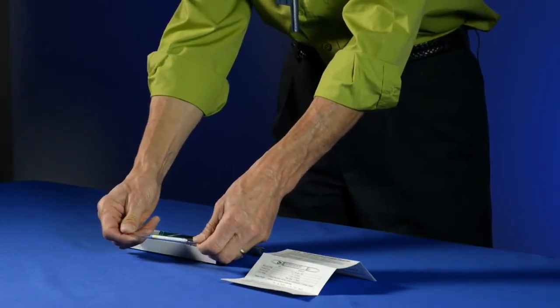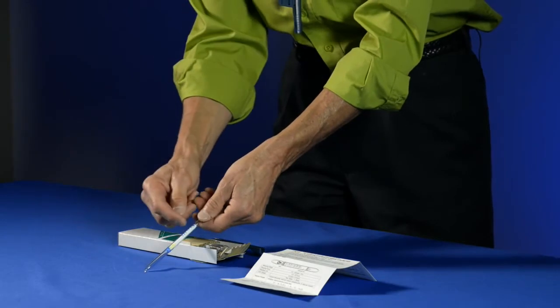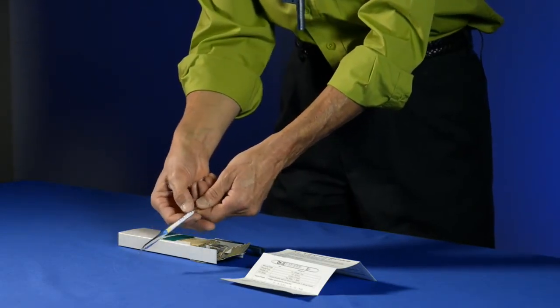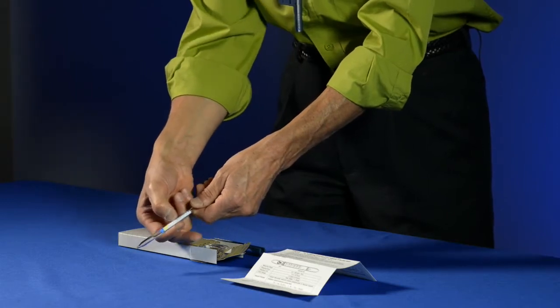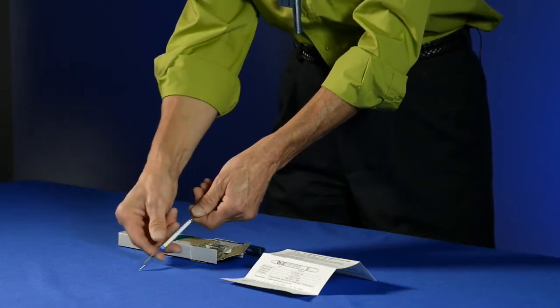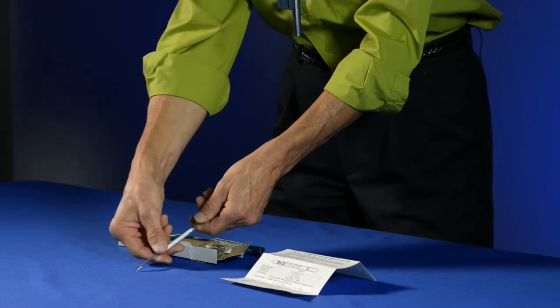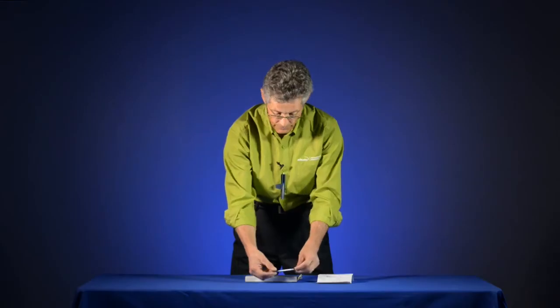It's a long, narrow glass pencil, and you can see it has a calibration mark, so it's pre-calibrated on here. It's accurate because it's been tested at the factory for those concentration ranges. So it's about the same accuracy as a small gas monitor for carbon monoxide.